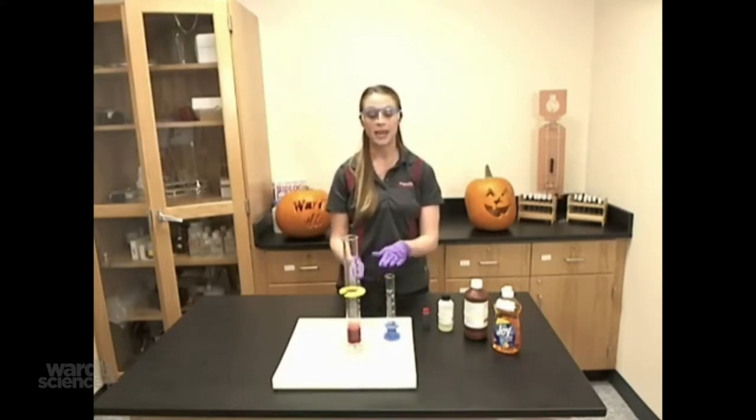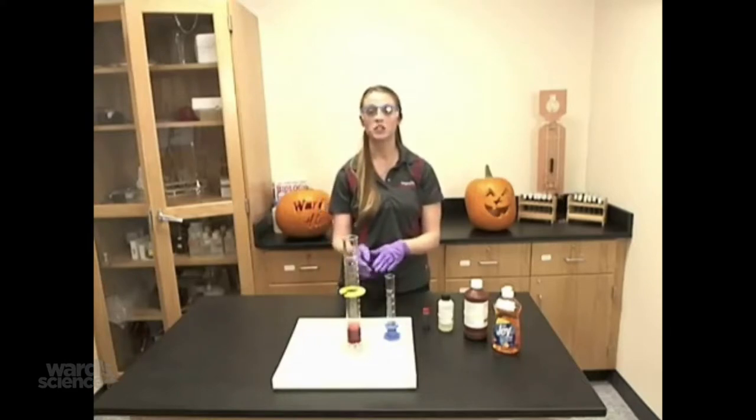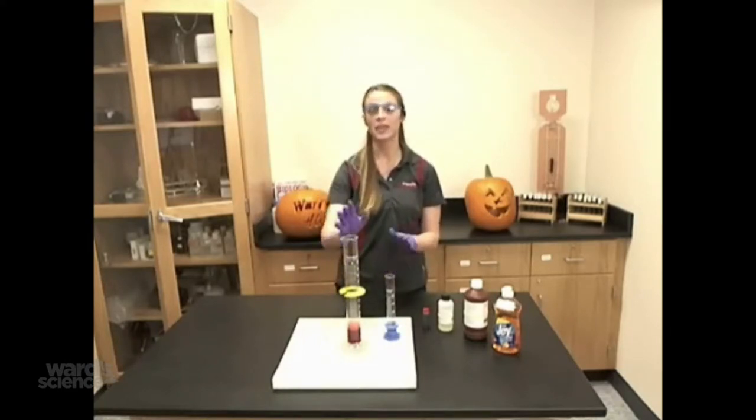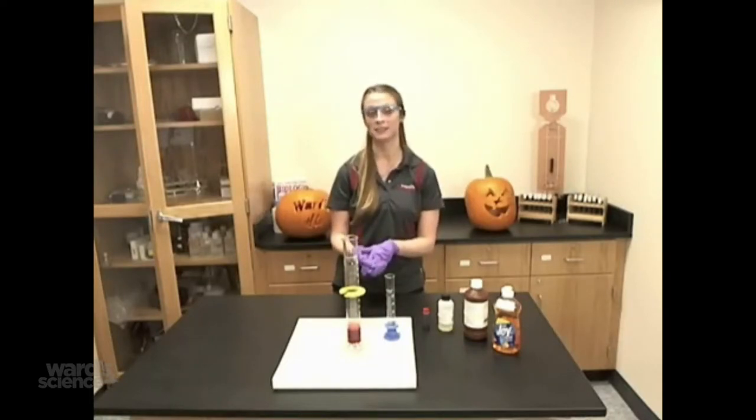Next, quickly add 15 mils of potassium iodide to the large graduated cylinder. After you do this, step away because it will be a very dramatic reaction.